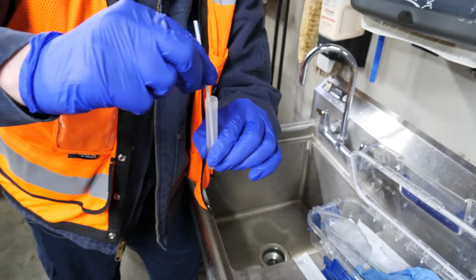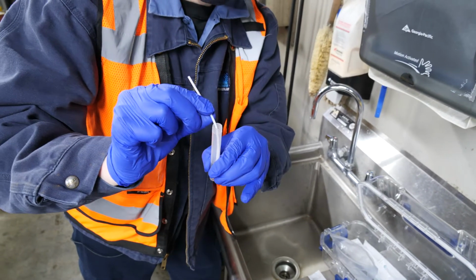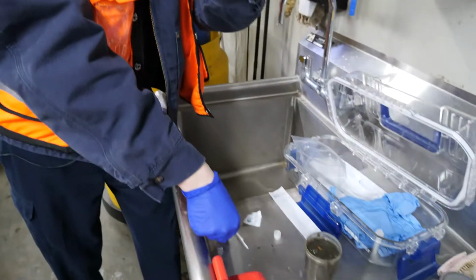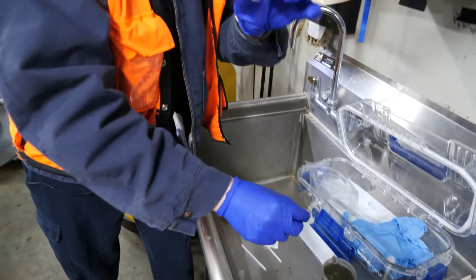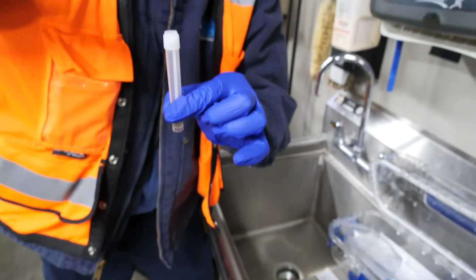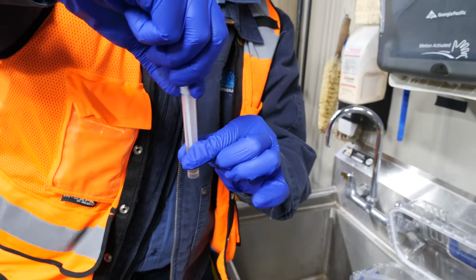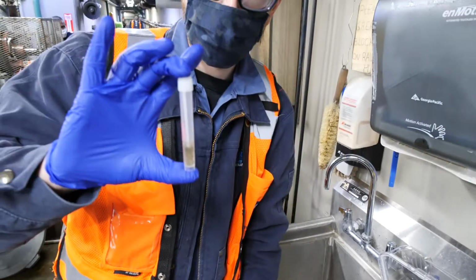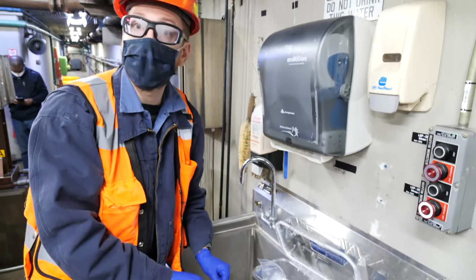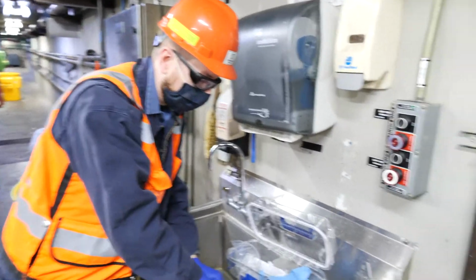And then I'm going to just tip it over and it's going to break. There's a perforation on each one of the samples and they'll snap right off. No problems. Take your lid, put your lid back on. That sample is done.